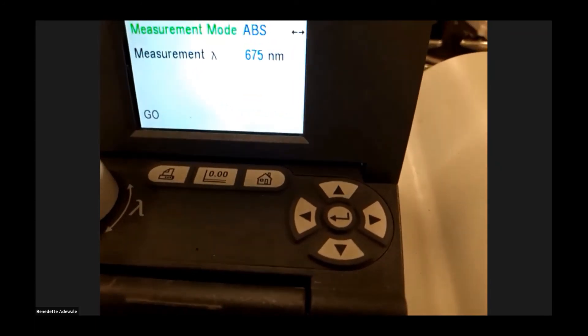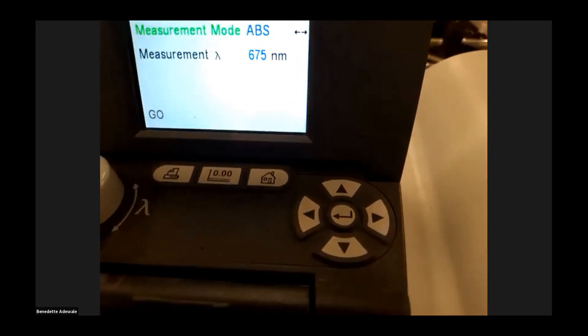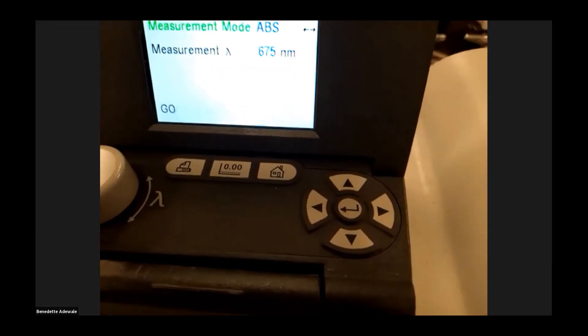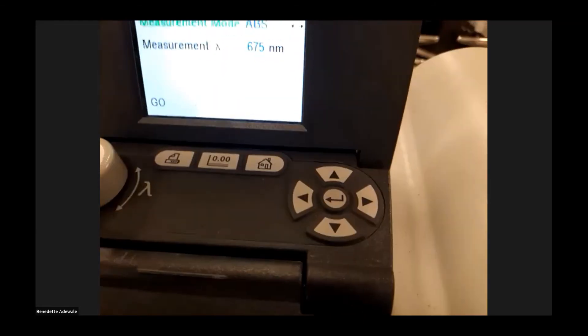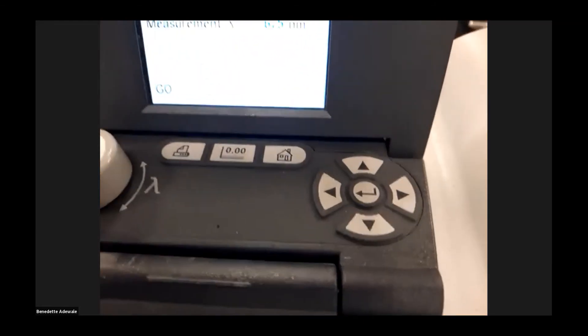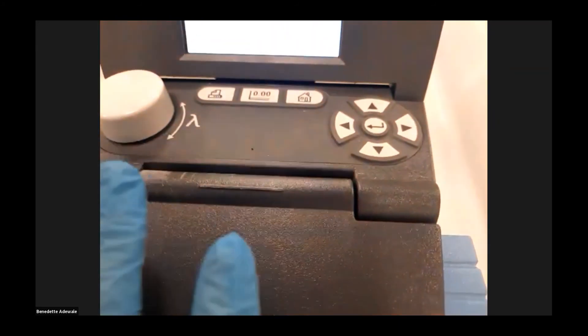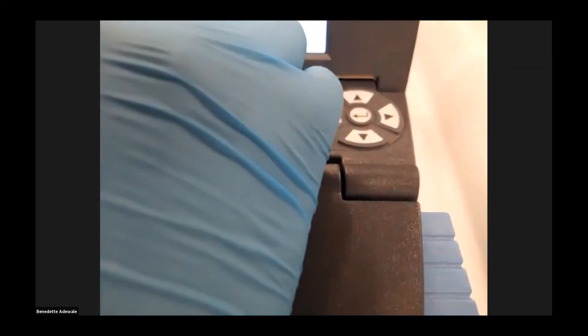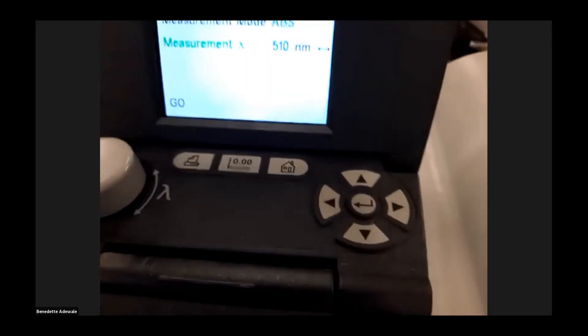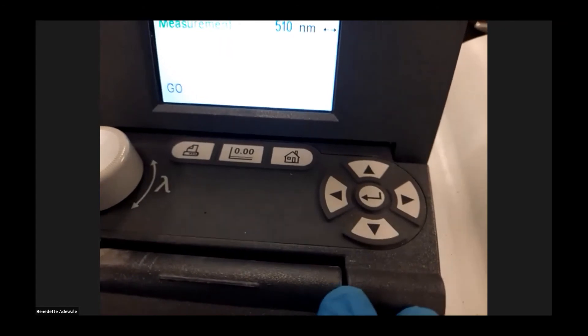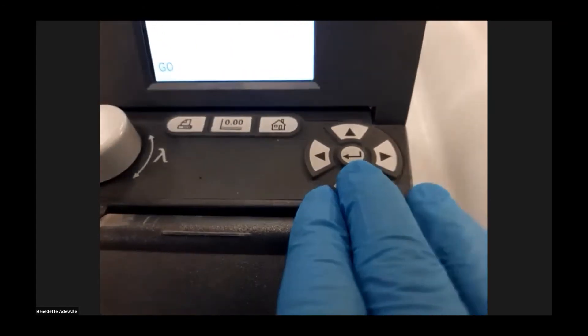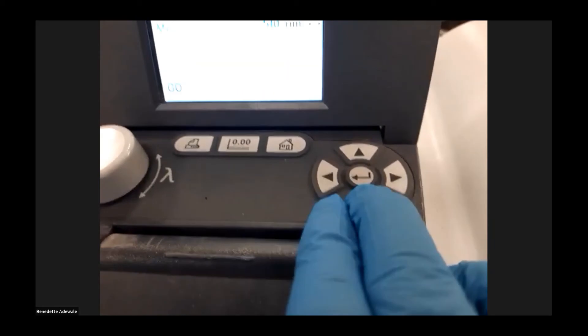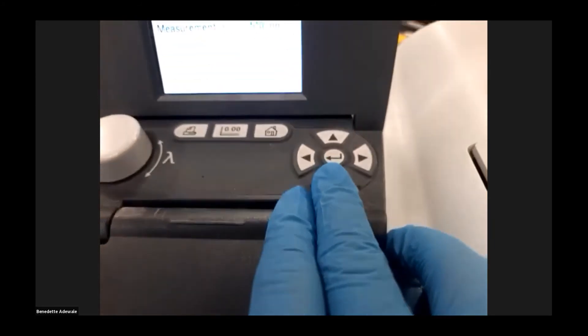In order to use the spectrophotometer, you need to know your wavelength. You have been given a wavelength of 510 nanometers. So you use the knob on the left-hand side to set it to 510 nanometers. Once you have your wavelength at 510 nanometers, then you press the lower arrow key, go, then you press enter.